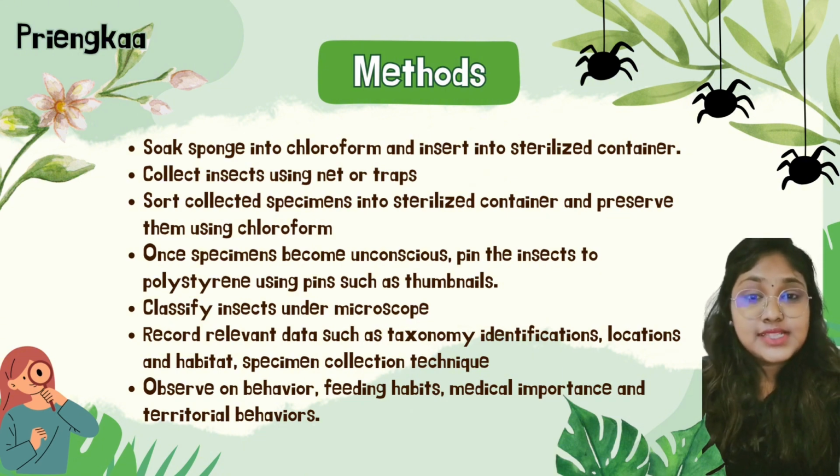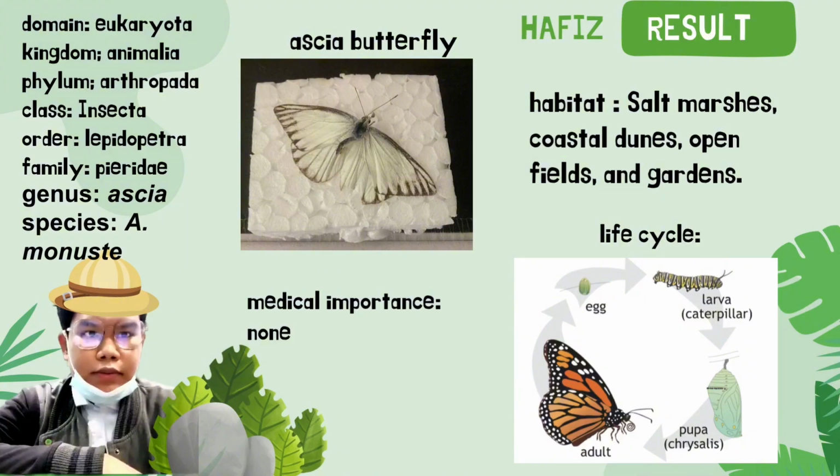Record relevant data such as taxonomy identification, locations, habitat, and specimen collection technique. Observe behavior, feeding habits, medical importance, and territorial behaviors.